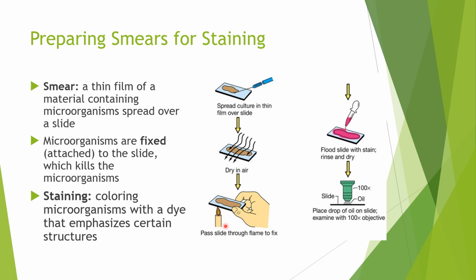Now, why don't you want to leave it on top of the flame for a long time? Because that can actually aerosolize the bacteria in the air. And again, that's dangerous because then you can end up inhaling it. That's why it's super important that you do this step very quickly.